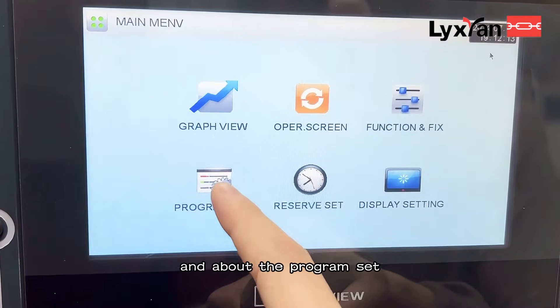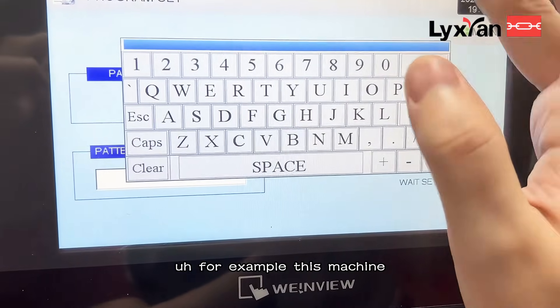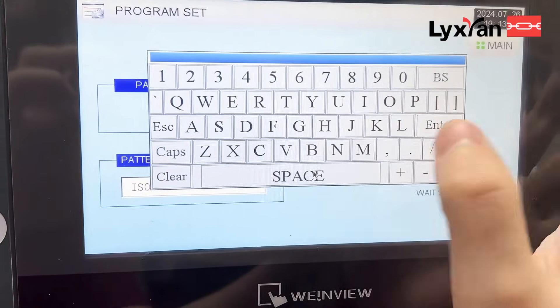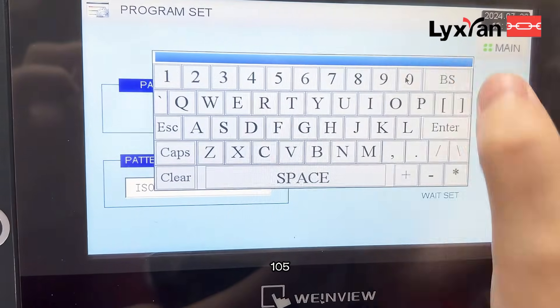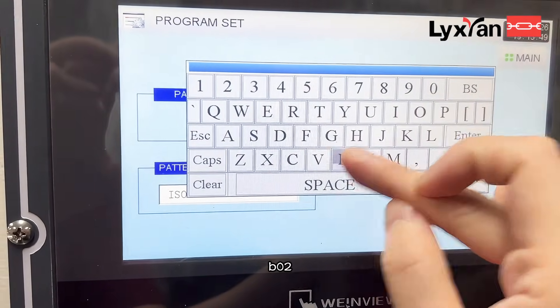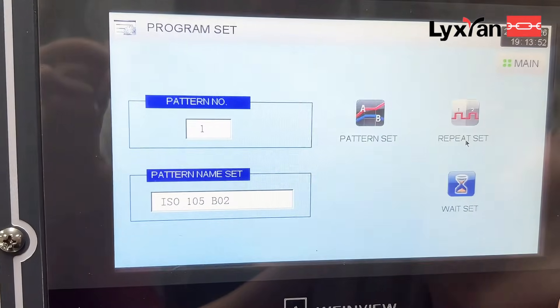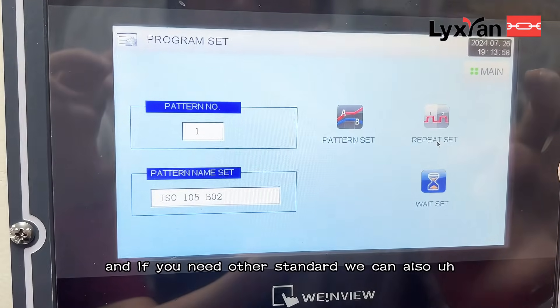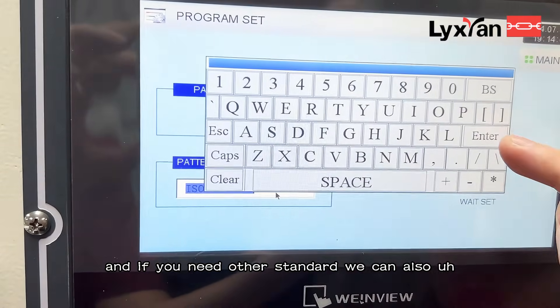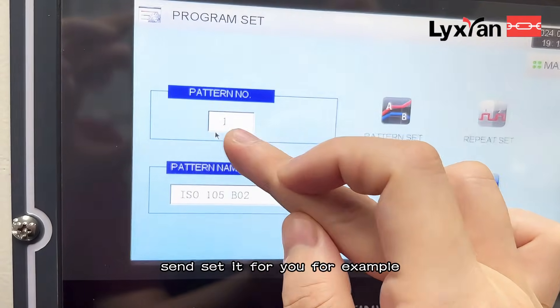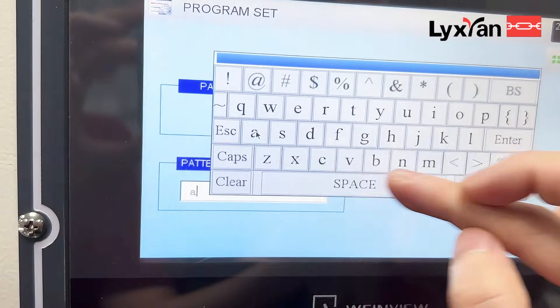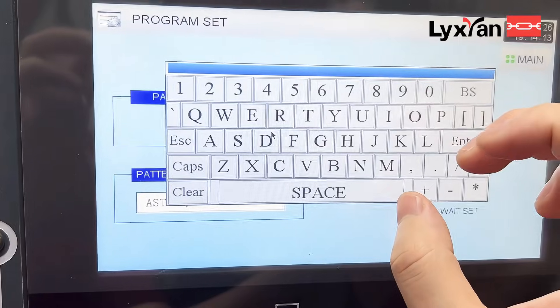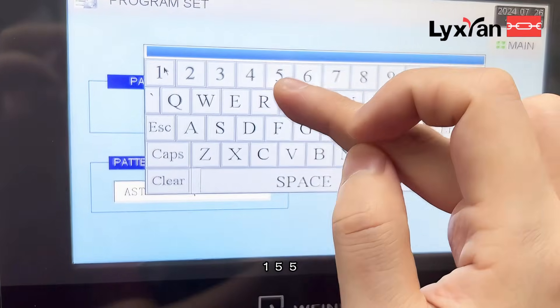About the program settings — for example, this machine needs to meet the standard ISO 105 B02, so we can set that standard for you. And if you need other standards, we can also set it for you. For example, ASTM G155.